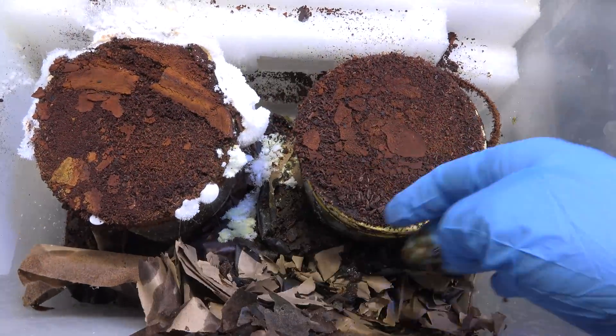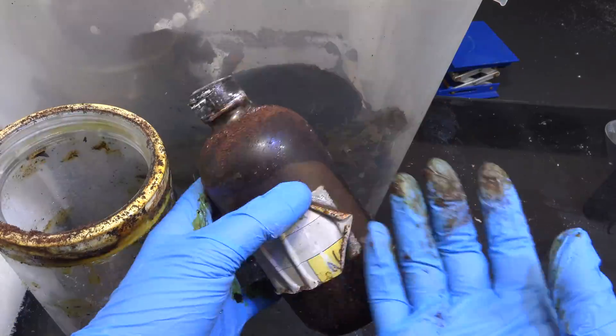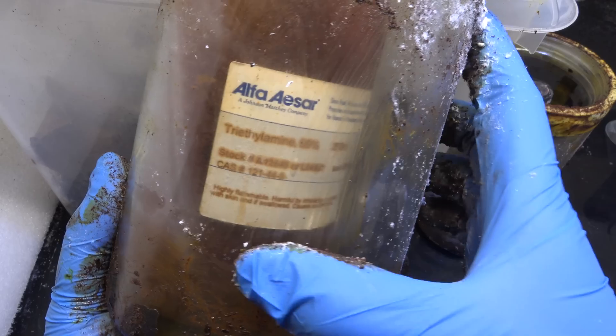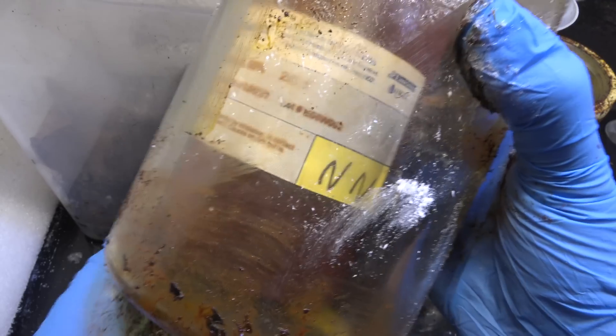Greetings, soil nerds. In a previous video I showed how bad storage had destroyed a number of chemicals like oxalyl chloride. Now in that storage unit I also had some triethylamine. Being several years old, this is certainly contaminated and should probably be discarded. Triethylamine is cheap enough that there is really no point to repurifying it.